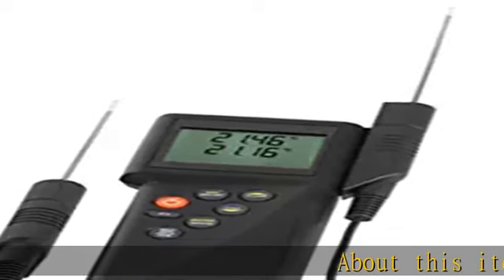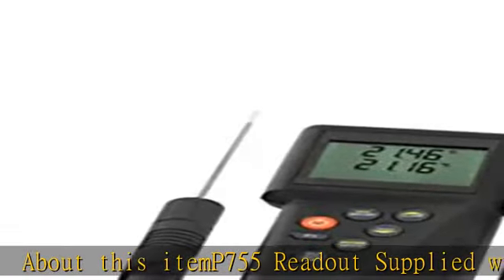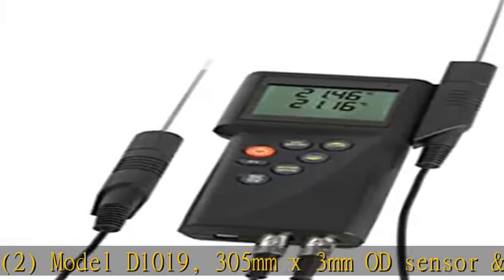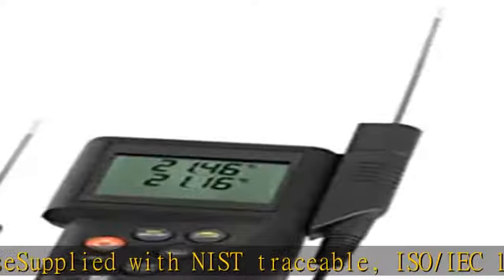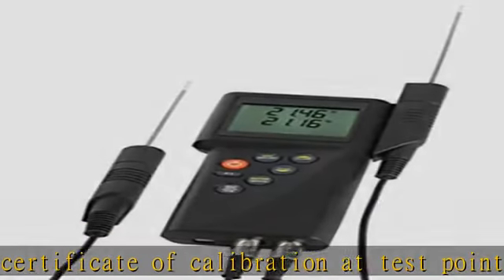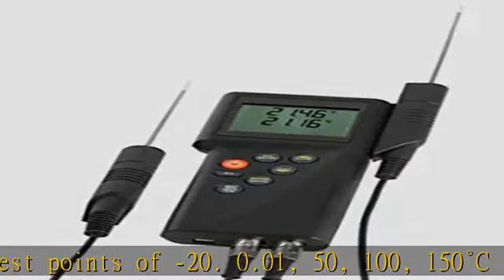About this item: P755 readout supplied with 2 Model D1019, 305mm x 3mm OD sensor and case, supplied with NIST traceable ISO/IEC 17025 accredited certificate of calibration at test points of minus 20, 0.01, 50, 100, and 150 degrees Celsius for each channel. Designed to meet ASTM D445 specifications, suitable for use as a reference standard or for kinematic viscosity resolution of 0.01.